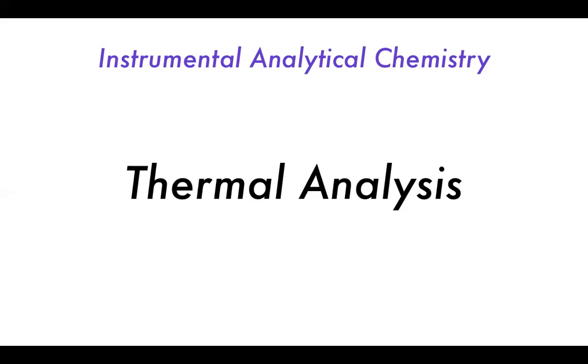Okay, so welcome to Instrumental Analytical Chemistry. We're going to be looking at thermal analysis today, which includes things like TGA, thermogravimetric analysis, which is basically a fancy way of saying we measure the weight or the mass of something as we heat it up. We'll also be talking about differential thermal analysis, that's hard to say, and differential scanning calorimetry, which are two different ways to measure the heat flow in a particular system.